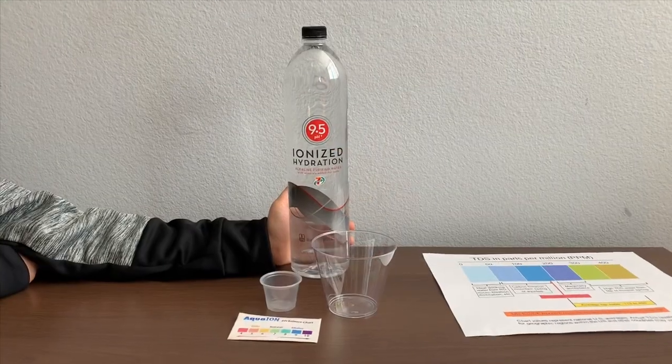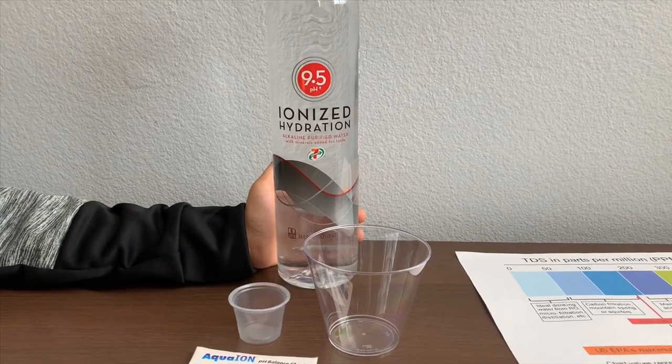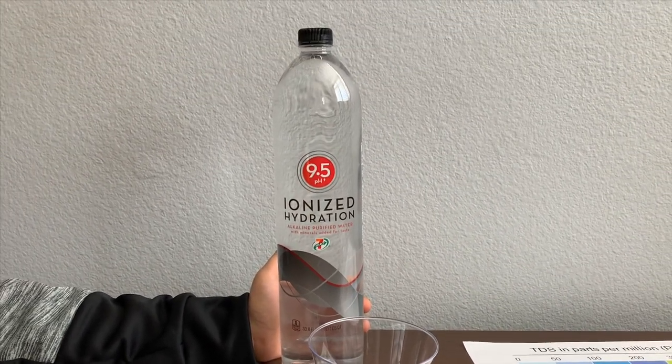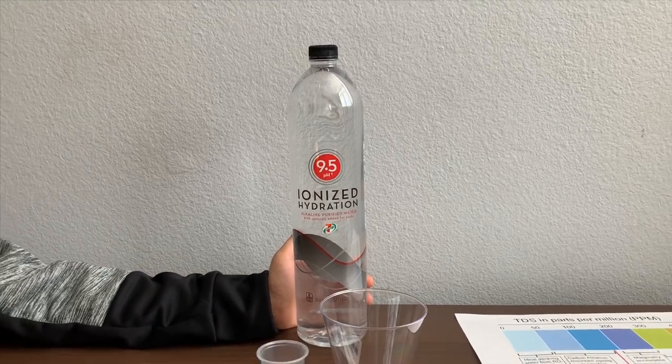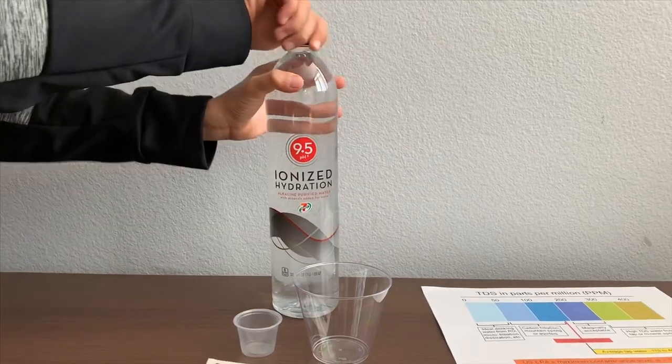This is 7 Select ionized hydration and alkaline purified water with minerals added for taste. The pH balance is supposed to be 9.5. It costs $2 and it is a product of the USA. Let's test the pH and TDS levels.